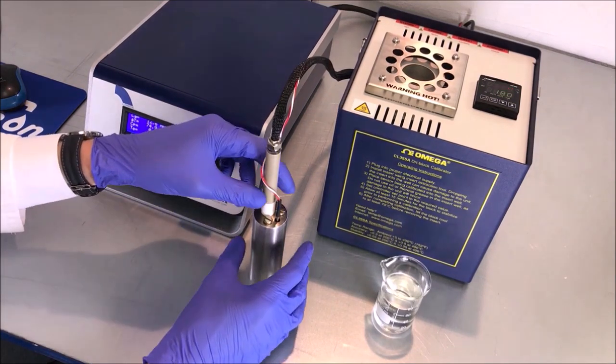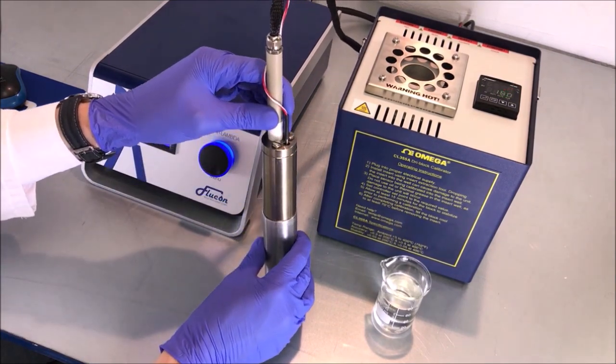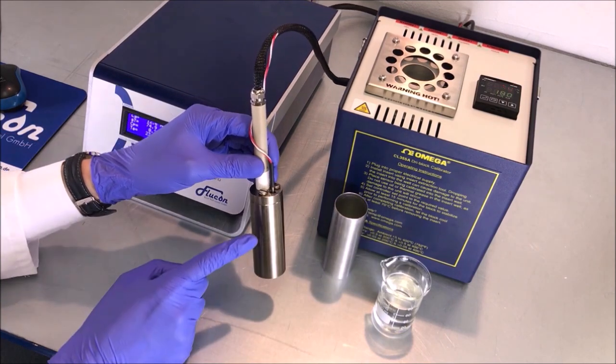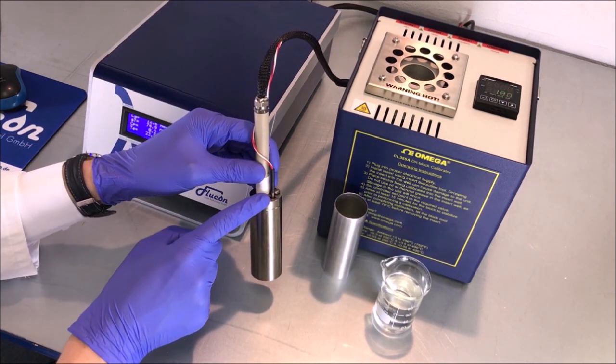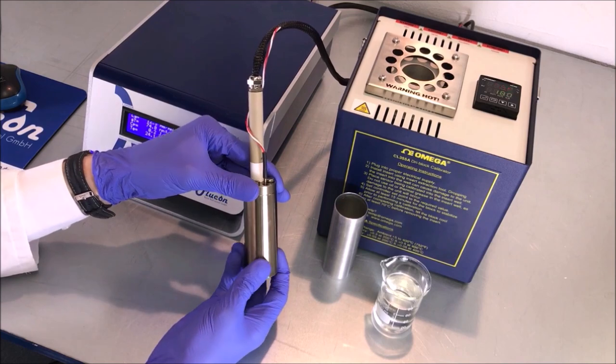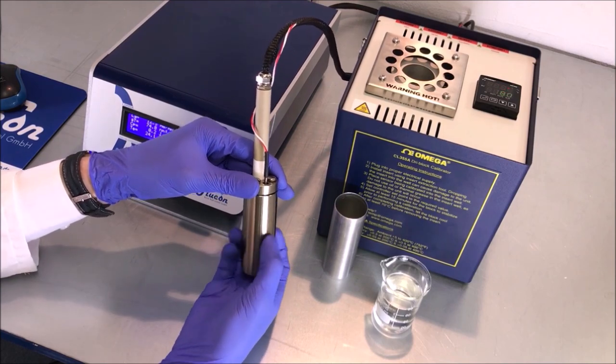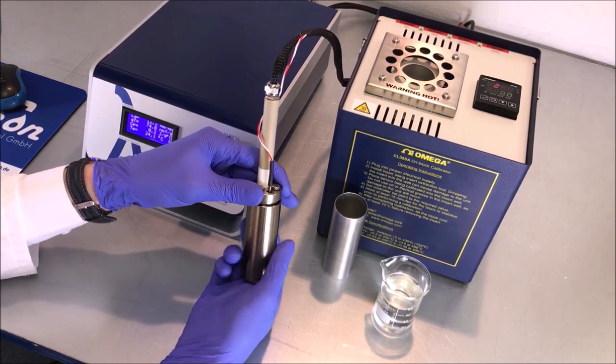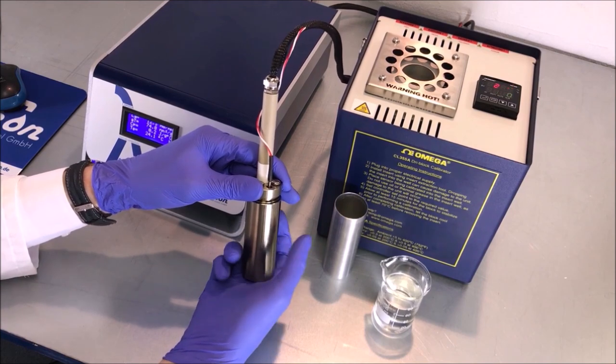First, pull the sensor out of the adapter sleeve. Next, you can unscrew the sample cup from the sensor head. Be careful with the last turns of the thread and make sure you hold on to the cup once it's loose.